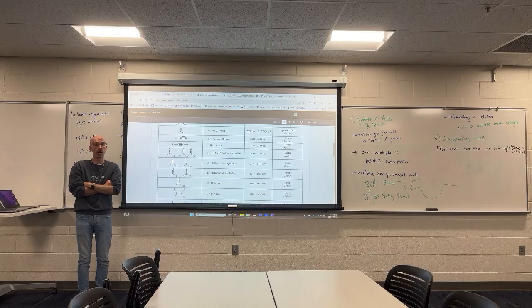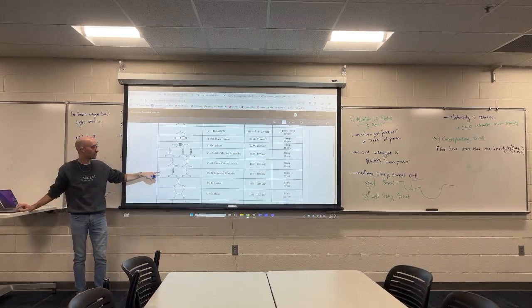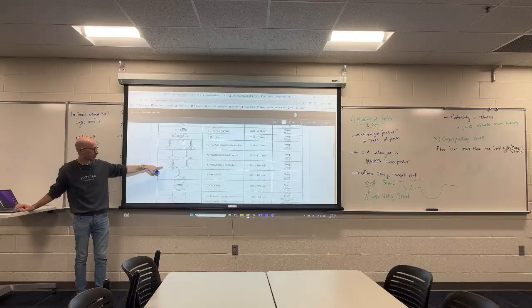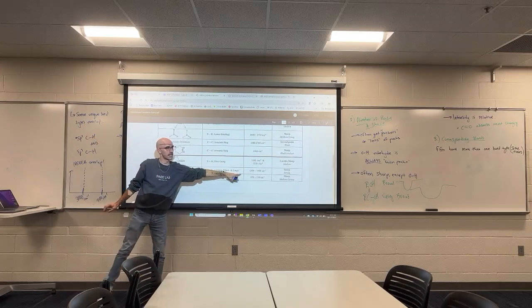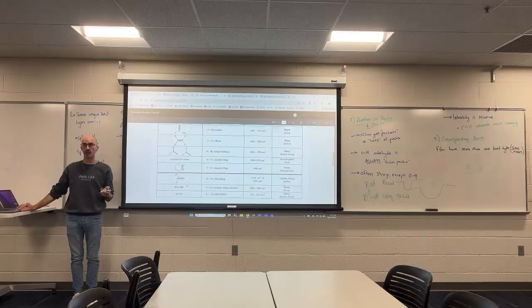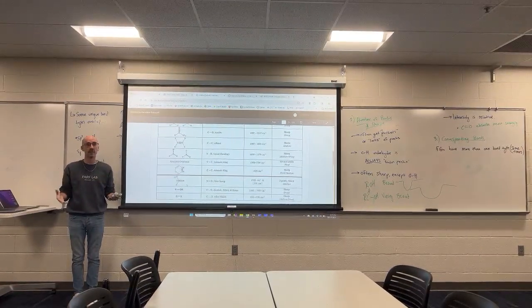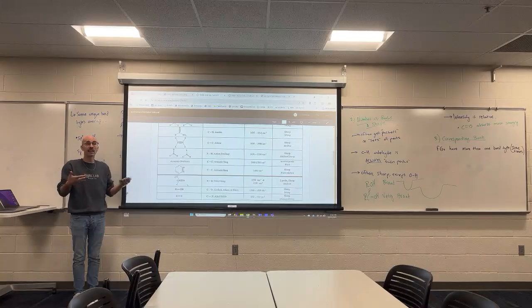The CO double bond of the ester absorbs between 1775 and 1715. The CO single bond of the ester absorbs between 1300 and 1000. You can't tell me the functional group absorbs there. The functional group is made up of multiple bonds, and those bonds can correlate.